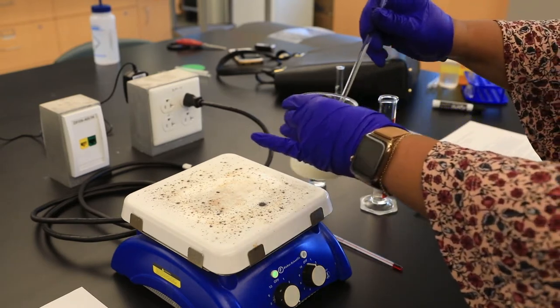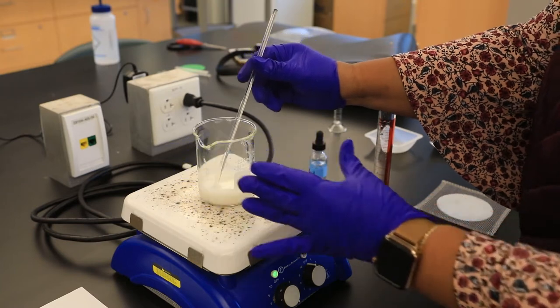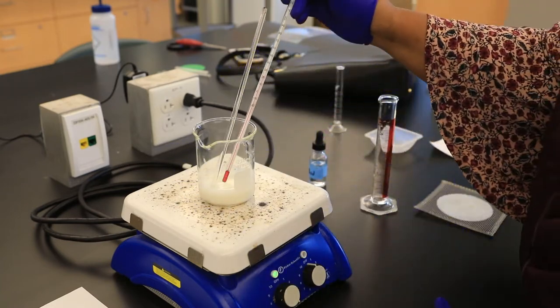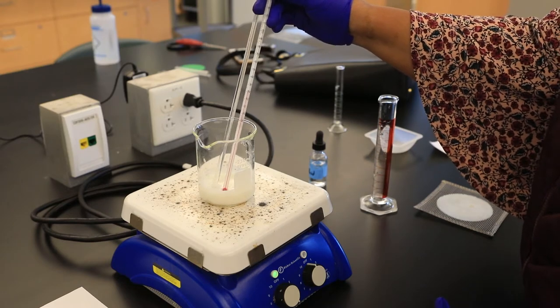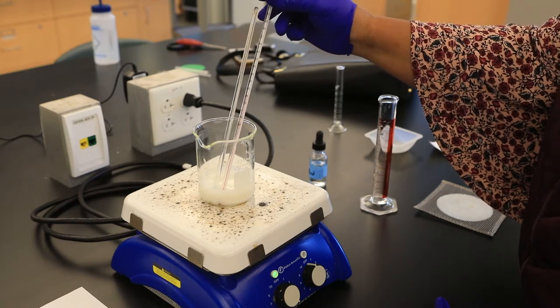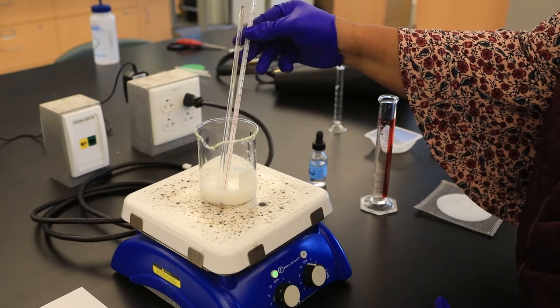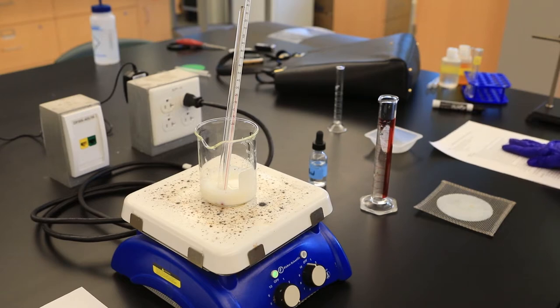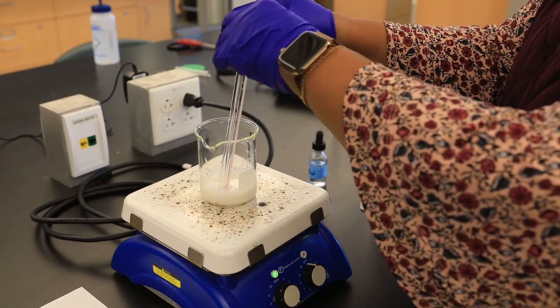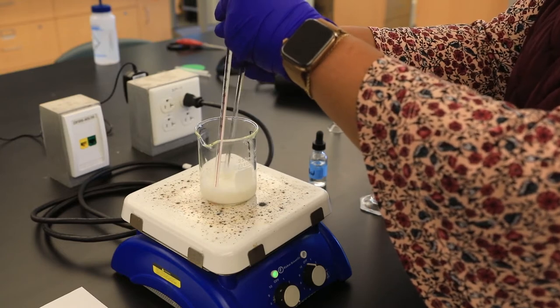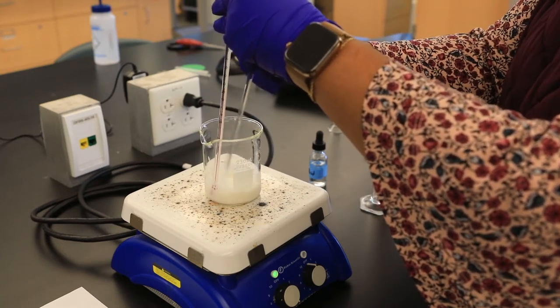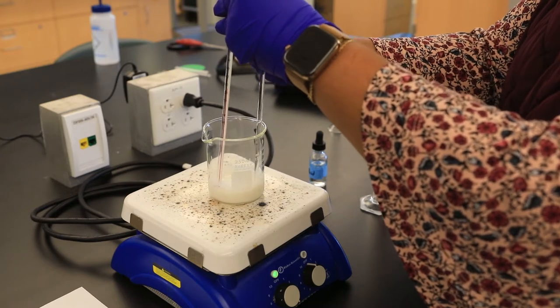We're going to transfer our beaker to the hot plate and monitor the temperature using our thermometer. Maintaining the temperature is extremely important in this experiment to avoid denaturing our protein. We want to make sure this temperature does not go above 45 degrees Celsius. While it's heated, we also want to continue stirring on and off to make sure the dry milk dissolves.